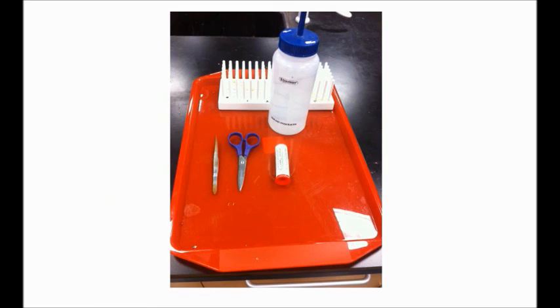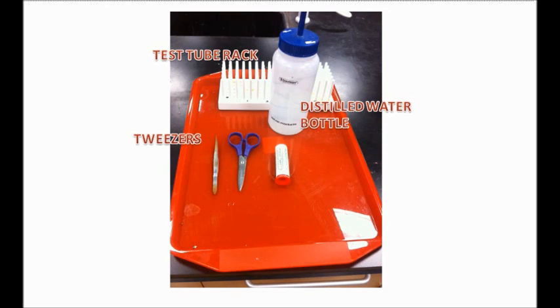And your materials are, you're going to be using distilled water in a distilled water bottle. That is to dilute the solid samples in powder form into a liquid sample that you can test pH with. You're going to be using the test tube rack to house the 8 test tubes. Tweezers to take the sample in microscale and put it in the test tube. Pair of scissors to cut the pH paper in thirds. And of course pH paper in strip form. I want that pH paper to be a little bit smaller so that we can conserve on using it.